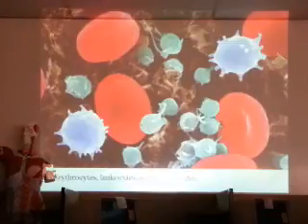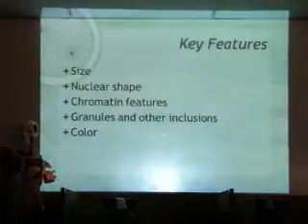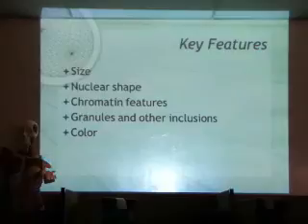So what we're going to look at are not the three-dimensional pictures, but two-dimensional pictures. But in your mind, try to remember that the cells you see under the microscope are really three-dimensional. And there are places where you can see that the cells have thickness. And that's kind of important, especially with red cells. So we'll come back to that.